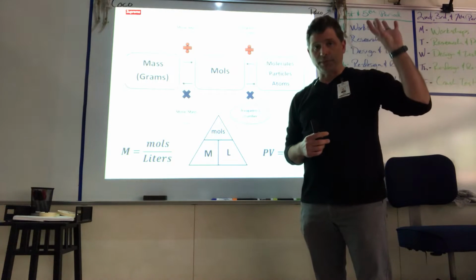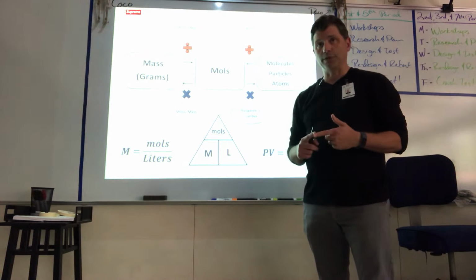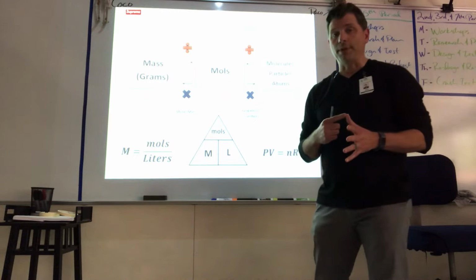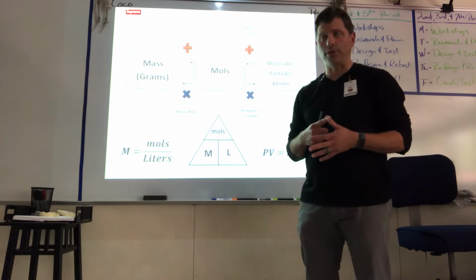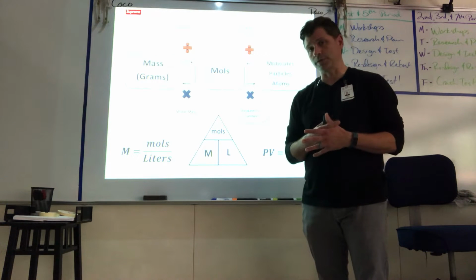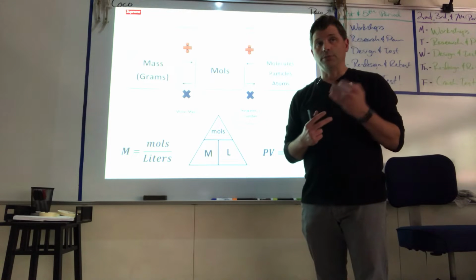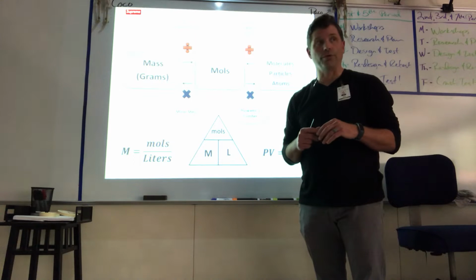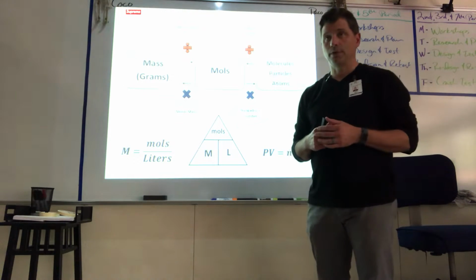I've got everything set up exactly the way it was yesterday. Every station has a graduated cylinder, a scale, a calculator, a periodic table, a couple pipettes and a spoon, and a Chromebook. At least there should be some Chromebooks. If there is no Chromebook or no scale, share with each other or use your phone for the Chromebook part or the scale. You'll just need to share.